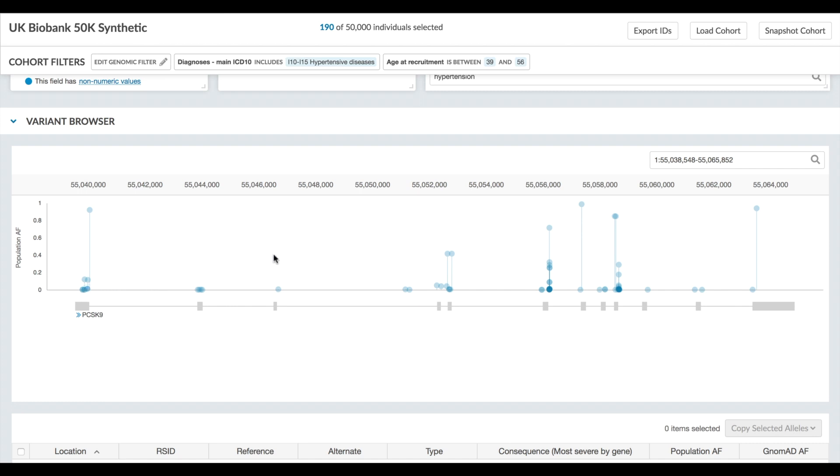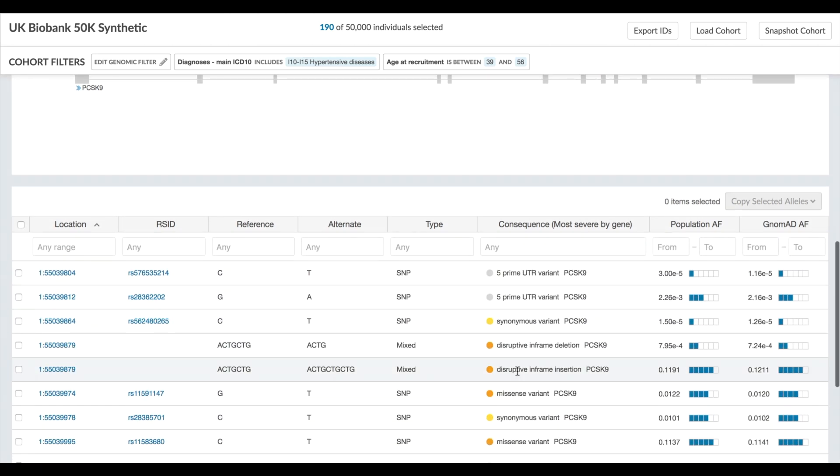Here we've filtered the cohort down to a subset of 190 people and we're looking at a region of the genome that contains the gene PCSK9.